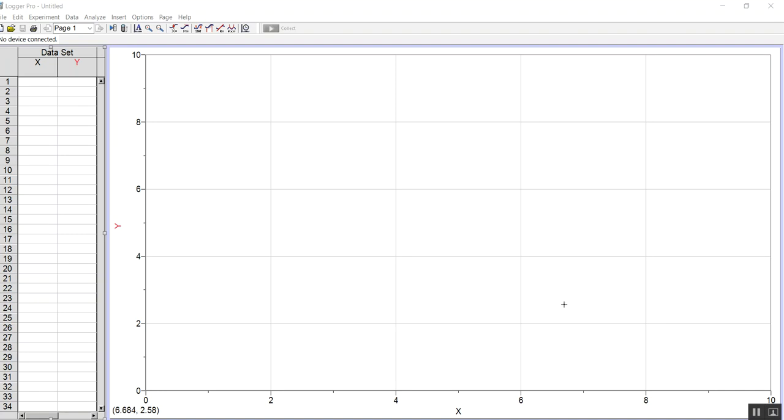Well, we're back here looking at the molar volume experiment, and I thought I'd do a little short video on the computer end of things. It probably didn't show up too well on the other one. So you're going to have your two probes. One's going to be to the pressure sensor, and one is going to be to the temperature.